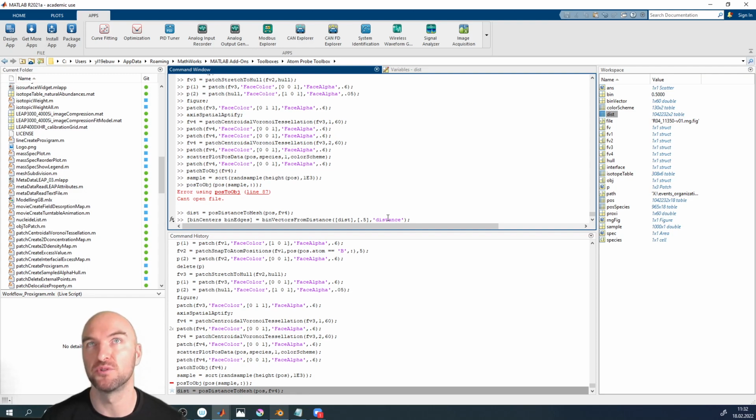What else can you use? You can use a charge state. In the charge state, it wouldn't make sense to bin by 0.5, because charge states are discrete. So you would bin by 1, because you would then bin by whatever charge state you have, for example, and create some analysis on that basis.